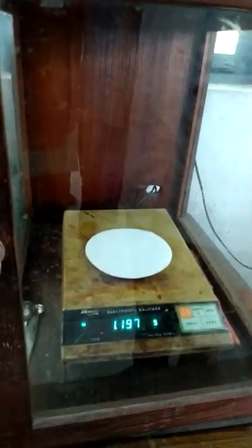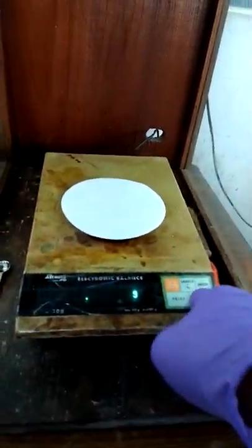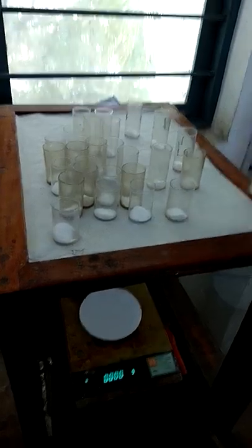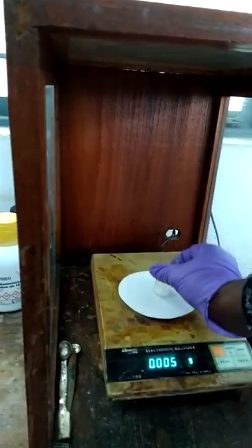First, what I should see is that the balance reading should be zero. If it is not zero, press the tare button, T-A-R-E, and make it zero. And then the sample will be kept here, the EDTA sample, and place it on the pan of the balance. Then close the door and wait for the reading to be stabilized. Write down the value, 5.587, which is the weight of sample and sample bottle.